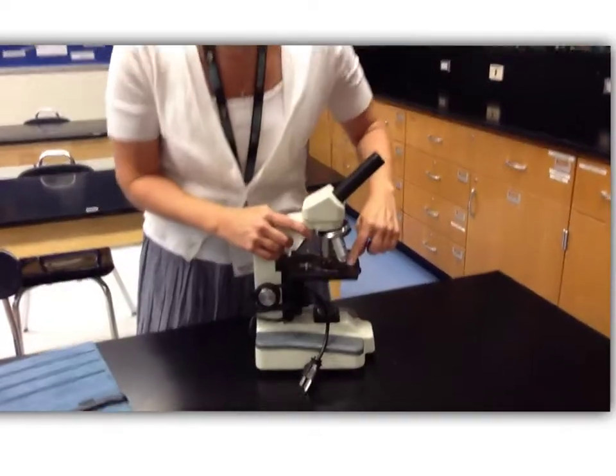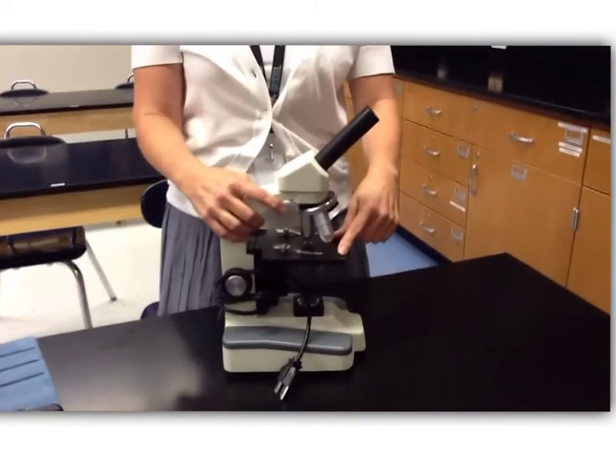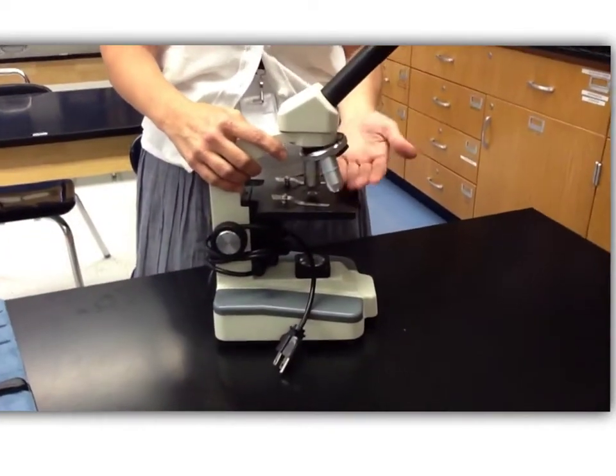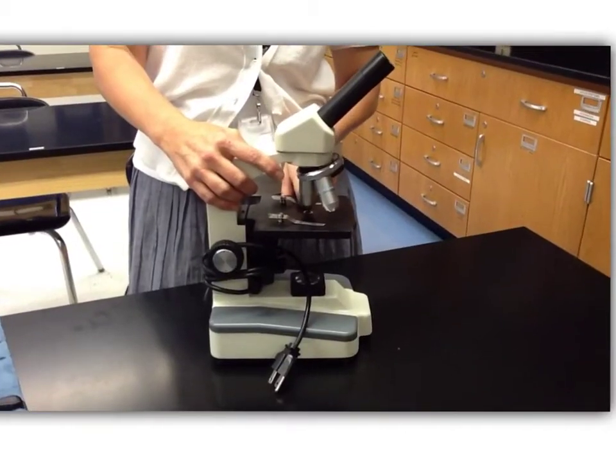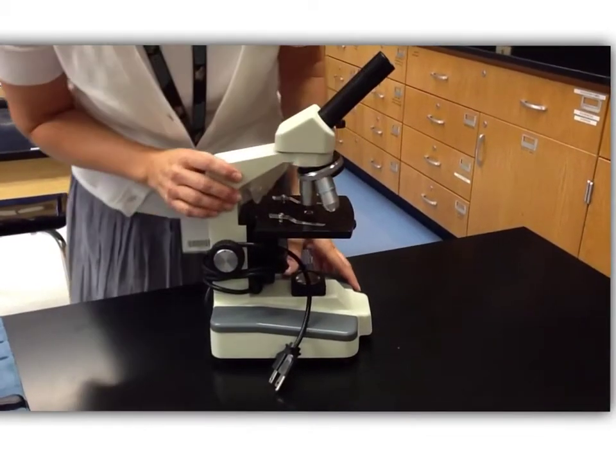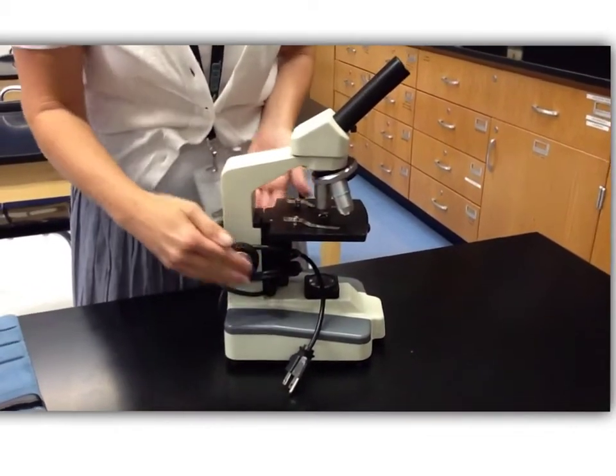Our objects get placed on the stage, which is going to hold them flat, and you place them underneath the objective lens, and we have focus knobs here.